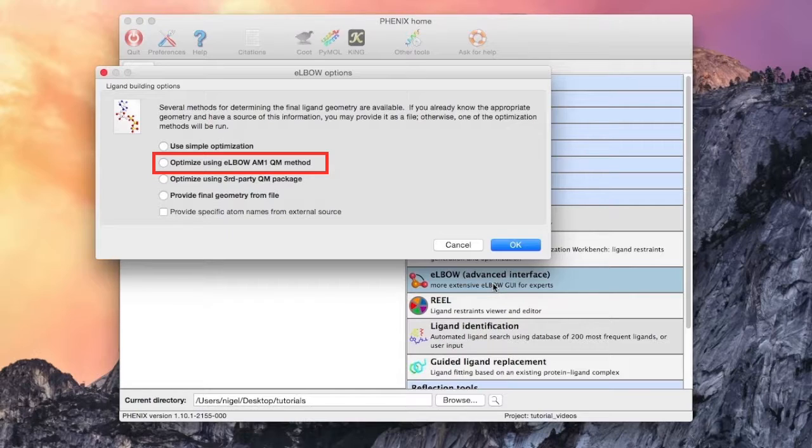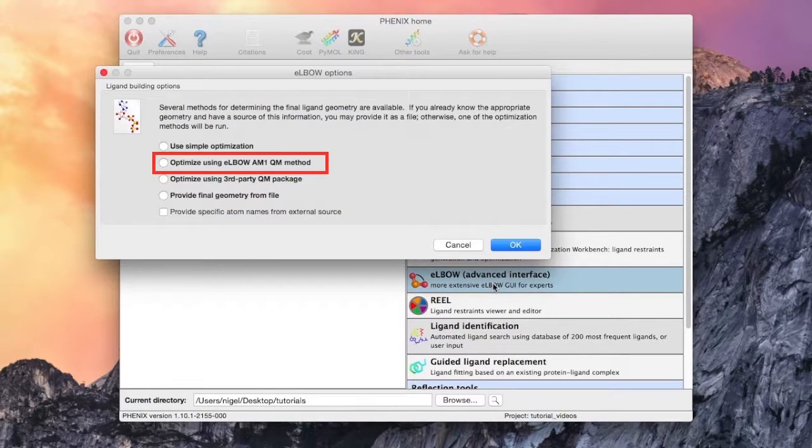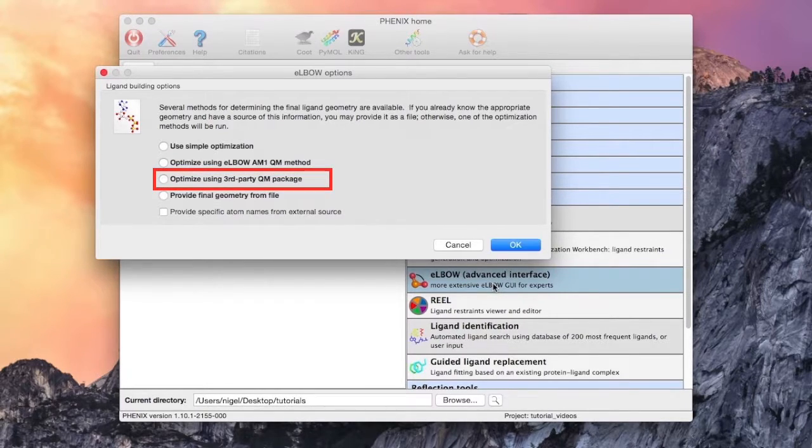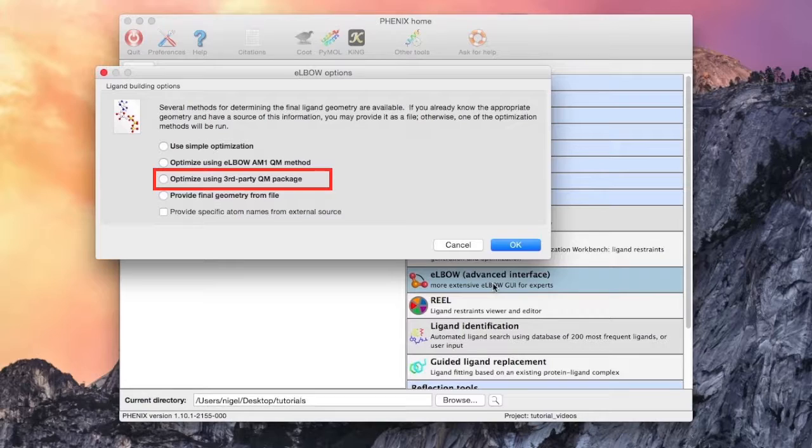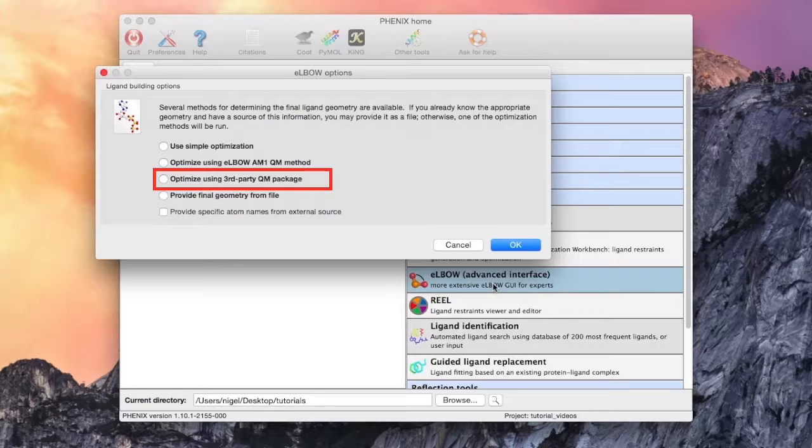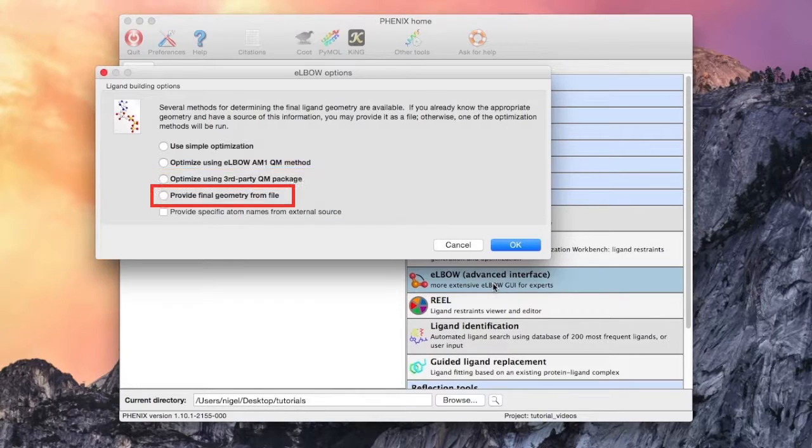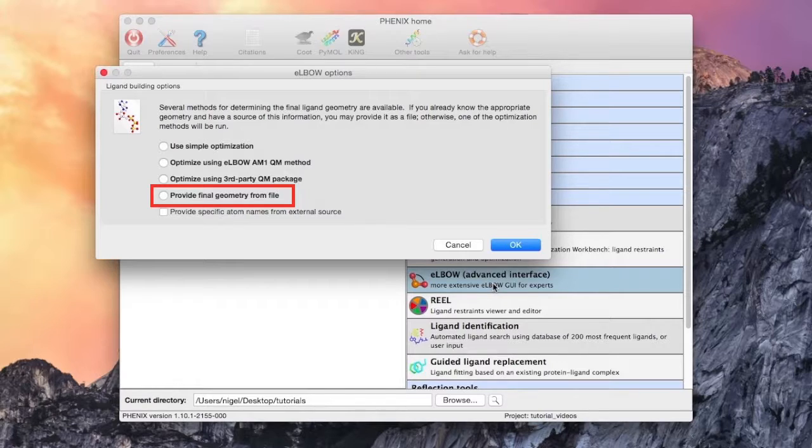The second option is a built-in RM1-AM1 semi-empirical QM method that is appropriate for most drug-like molecules. The next method uses a feature in Elbow that can use third-party QM packages such as GAMESS to generate high-level QM geometries. This requires additional setup. The final radio button option is to provide a Cartesian geometry from another file such as a PDB file.